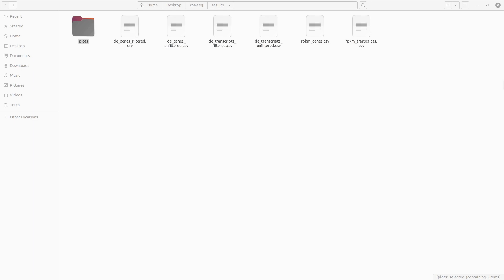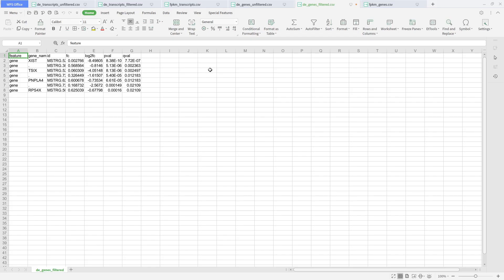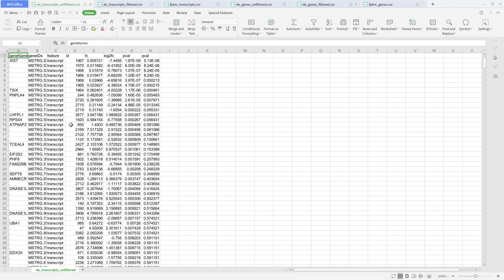We have the files here. You can open the CSV files using any spreadsheet software. This is how they look. Let's start with the transcripts — we have the IDs, the full fold changes, lock to fortune, the p-value fields, so here you can manually inspect the data and try to get some additional information.